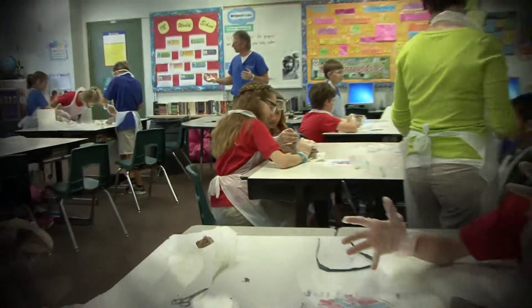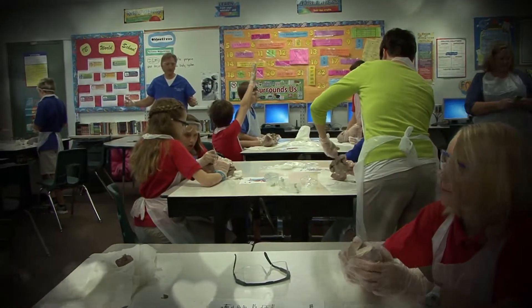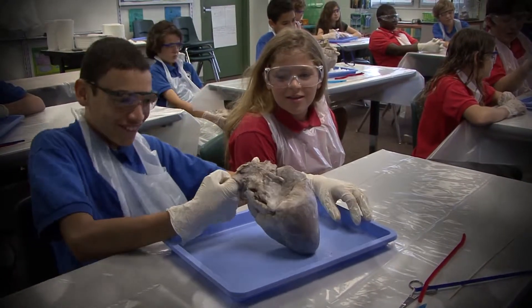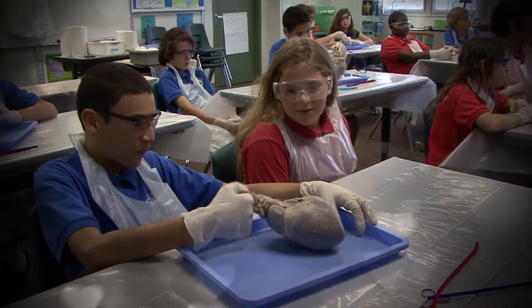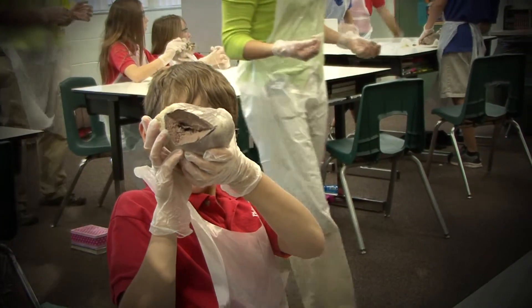So what are the valves for? Making sure the blood only goes one way. Yeah, making sure it goes in the right direction. So if you didn't have a mitral valve, what would happen? It would go backwards — it would go forwards and backwards.